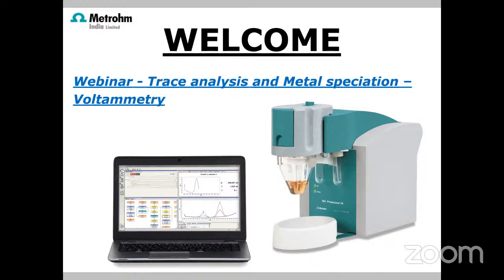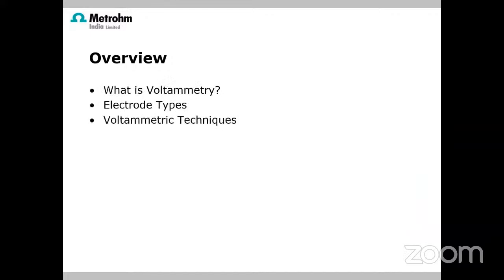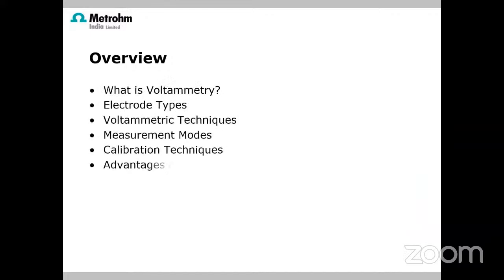A very compact instrument, and as the heading says, trace analysis and metal speciation. So I welcome you once again. We will see an overview of what is voltammetry, what the electrode types are, what voltammetry techniques are available, measurement modes, calibration techniques, advantages, and summary.